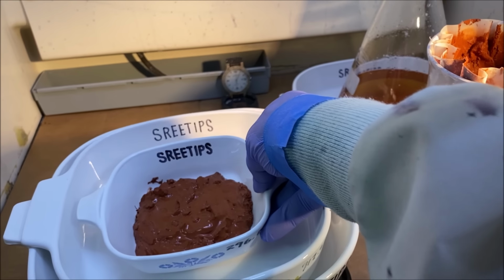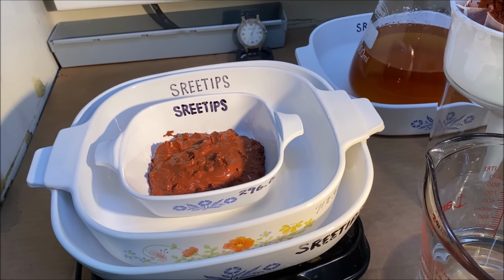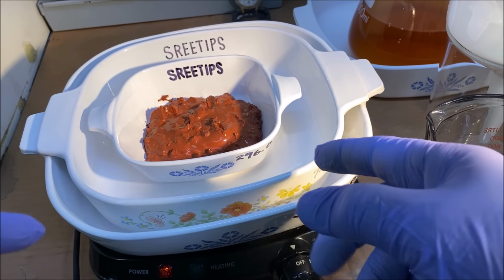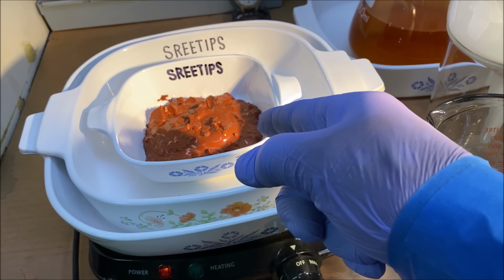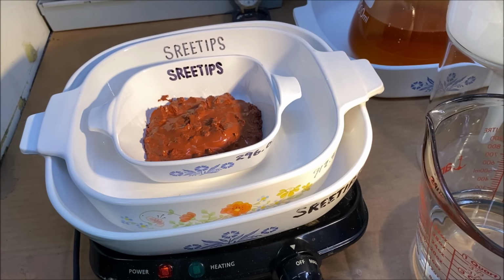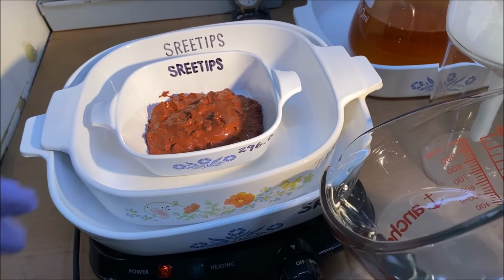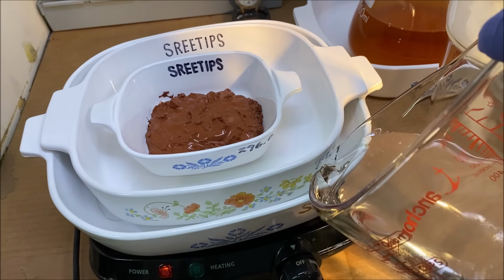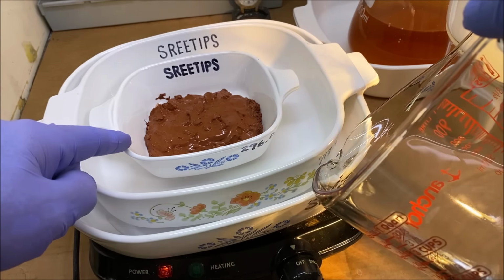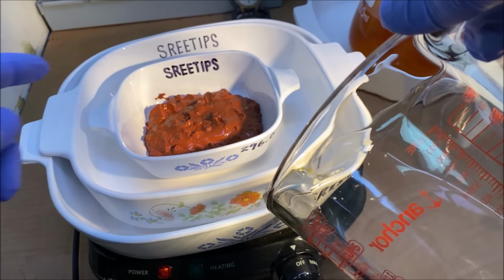Dish over here on a heat source. And the only way to do this is to heat it with a water bath, because that stuff is soupy. And if we tried to heat it directly, it'd spatter everywhere. So I'm going to add some water to this dish, and we'll start heating the water, which will transfer the heat to this dish, and then it'll slowly dehydrate our platinum material.